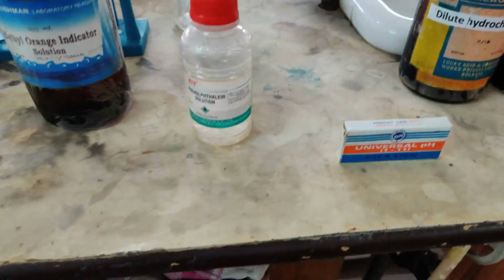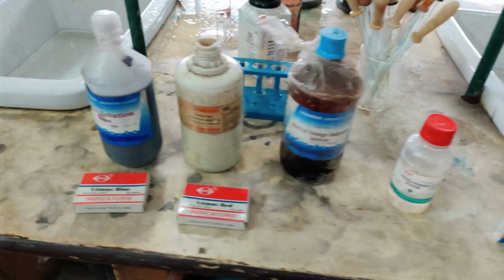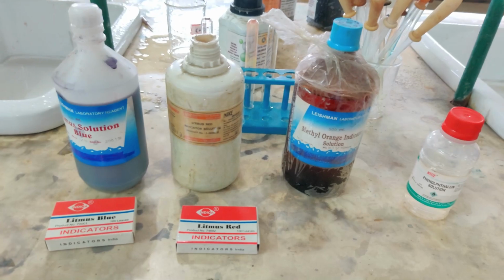Then let us see now the test of acid or base by using these three common indicators.